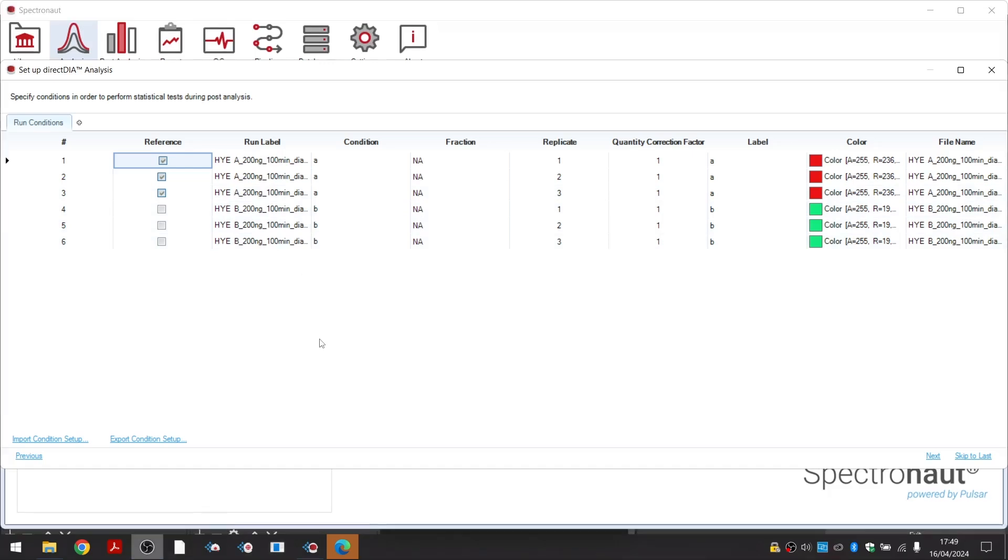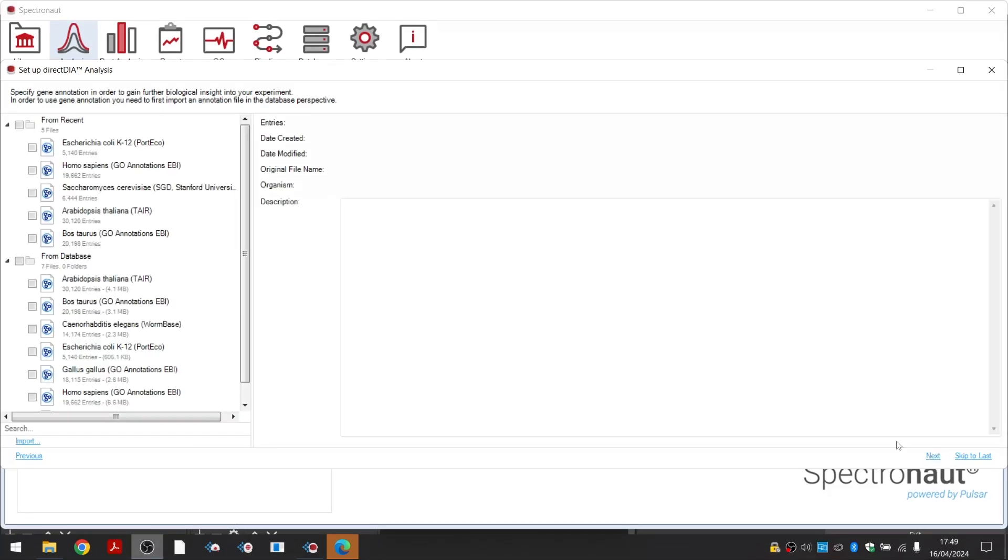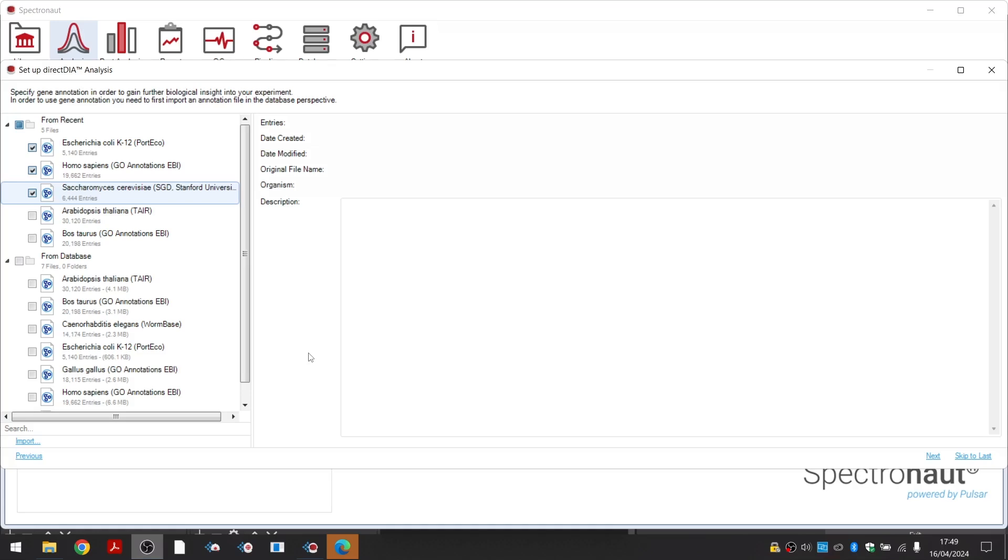On the next wizard page, you can select GO annotations to further annotate your data. Spectronaut will not only perform differential abundance analysis on the protein group level, but also GO-term enrichment analysis, showing which GO-terms in the candidates list are over-represented compared to the identified proteome background.